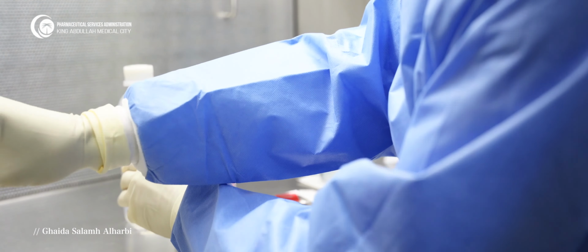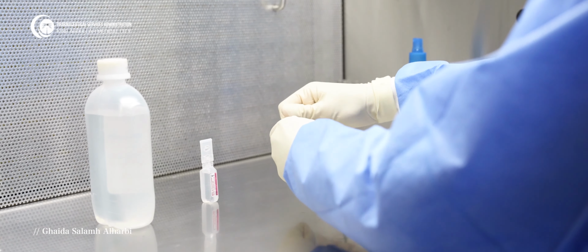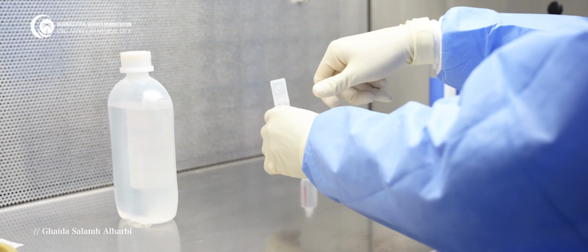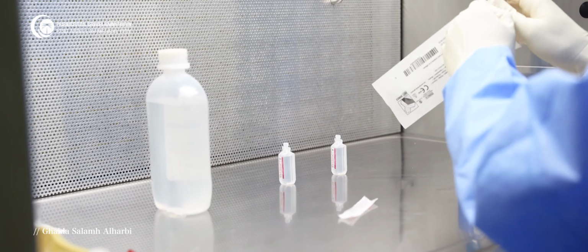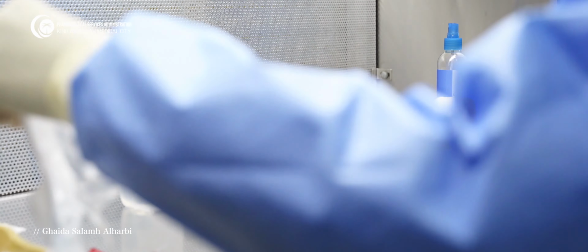If I have preparation for a ready-made item, I will use only a syringe with needle and final container, like in this video, a 500 ml container. I will disinfect the septum 3 times, same direction.